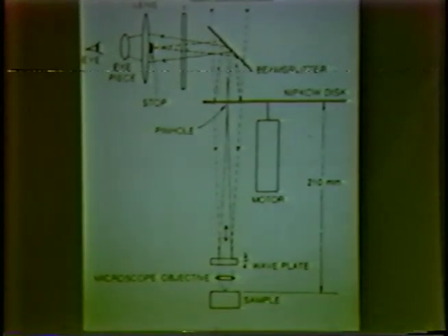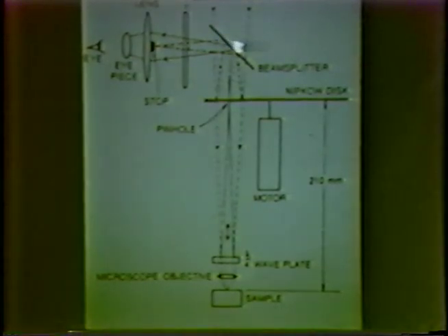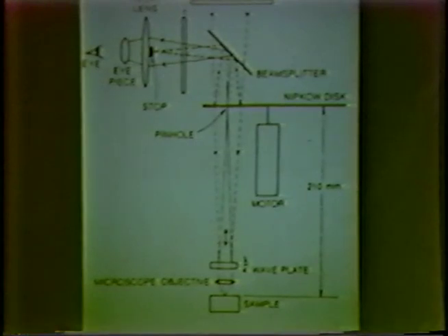And if you're interested in using one of these microscopes to image the reflection from a surface, which, as I shall show you shortly, is also a very interesting thing to do, then this is a useful configuration. They can also stop a large part of the unwanted light because it's brought to a focus at a different point than the light returning from the specimen by putting an opaque stop in the center of the device, and they can also tilt this disc with respect to the illuminating beam. But never mind, they haven't yet shown that it will work on biological samples.